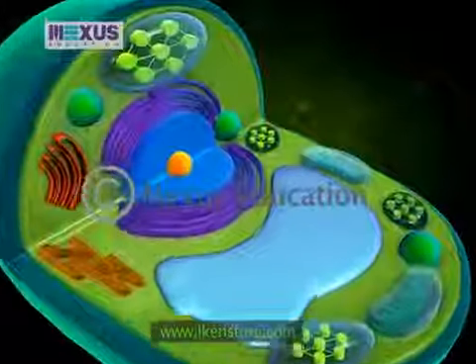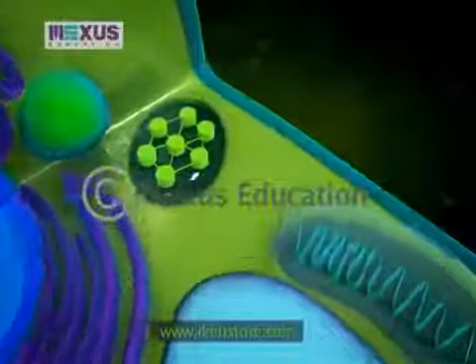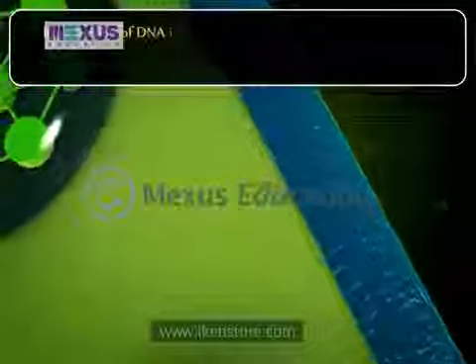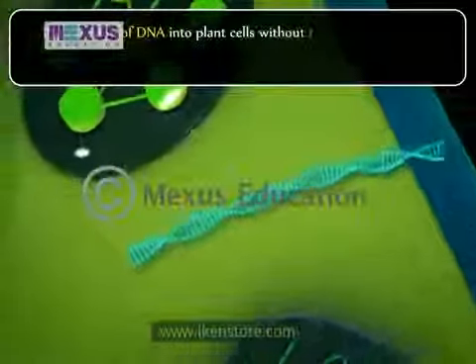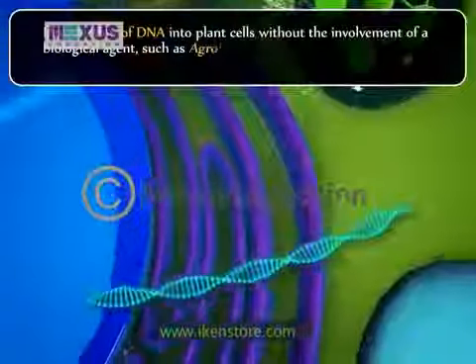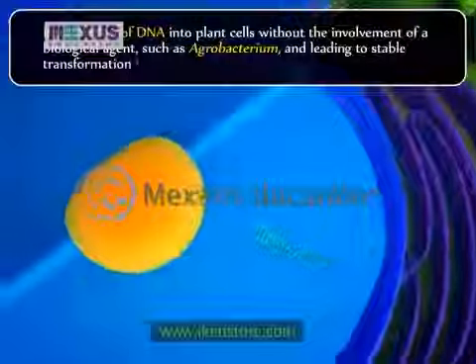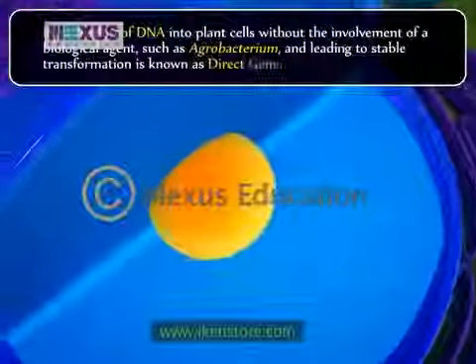The second category of transformation techniques is direct gene transfer. Introduction of DNA into plant cells without the involvement of a biological agent such as agrobacterium and leading to stable transformation is known as direct gene transfer.